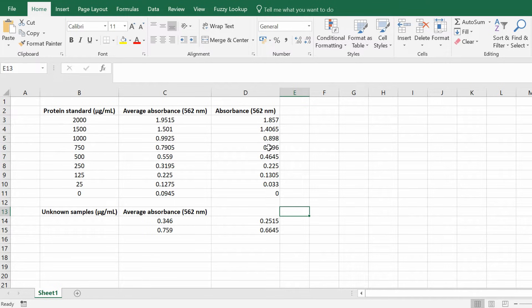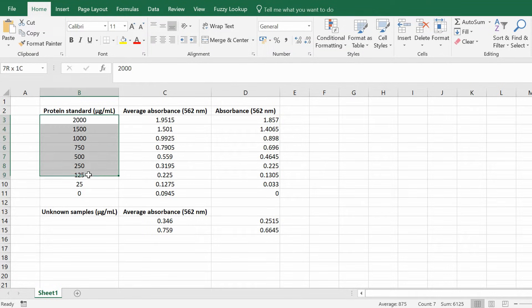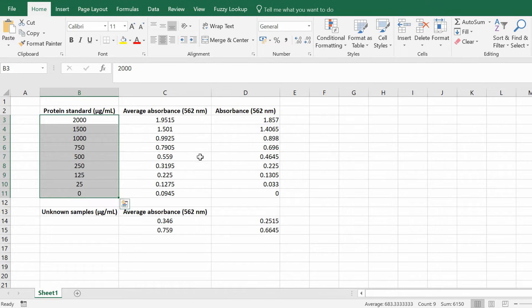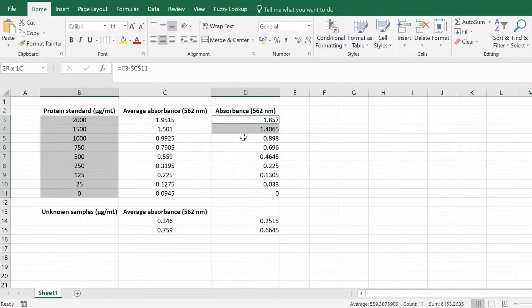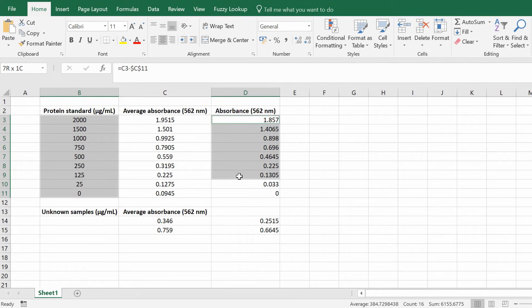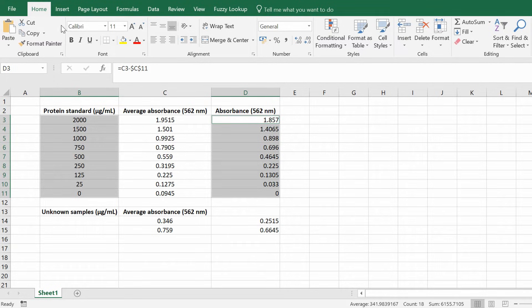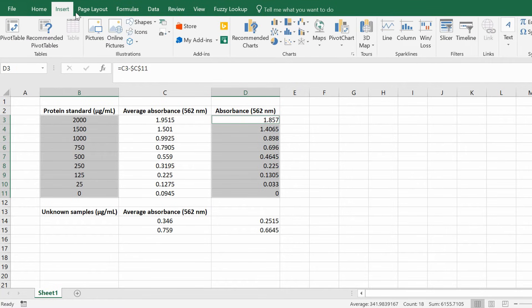Now to do this in Excel, simply select the known concentrations as well as selecting the background corrected absorbance values. It's very important you do the background corrected. I'm just going to hold this control key down on my windows and drag and drop and what you want to do is go in the top ribbon in Excel and go and insert.